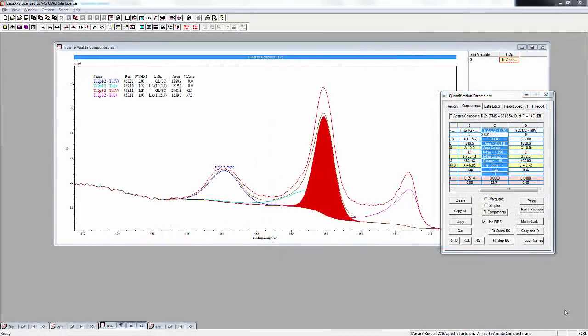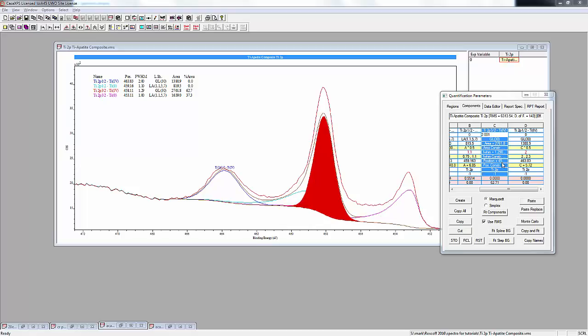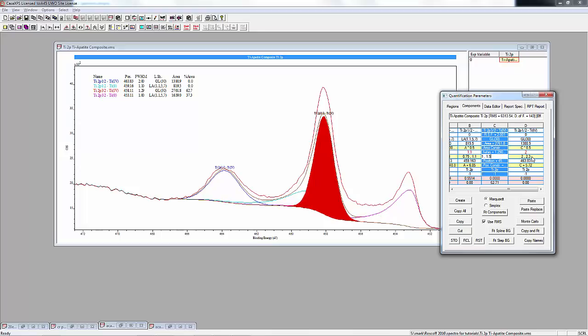We've added in the constraints for the titanium oxide. The area for the 1/2 peak is constrained to be half of the titanium 2p3/2 peak. The full width half maxes for the main 3/2 peak between 1 and 1.5 eV. For the 1/2 peak is much broader in titanium, so between 2 and 2.3, and again this is all from standard spectra. The position constraints - the 1/2 peak is going to be 5.72 eV above the 3/2 peak.